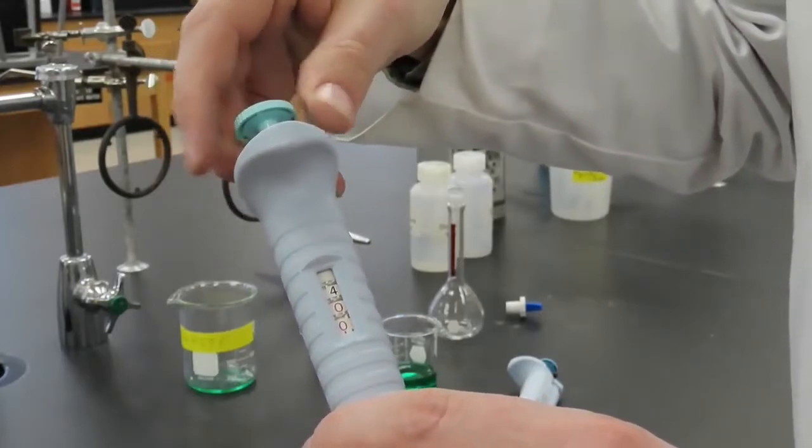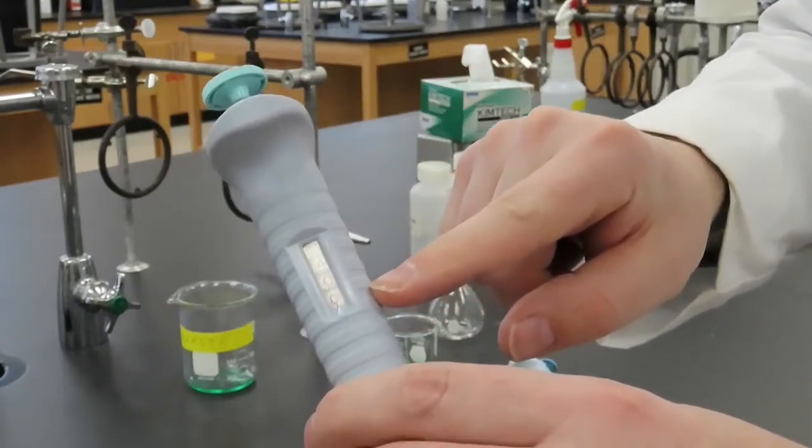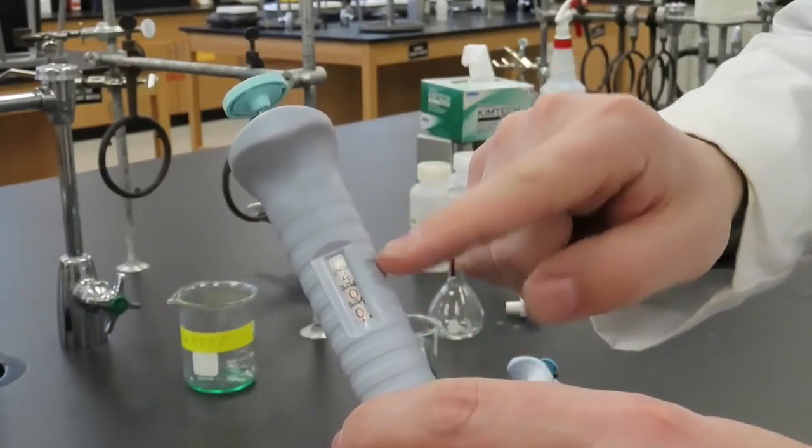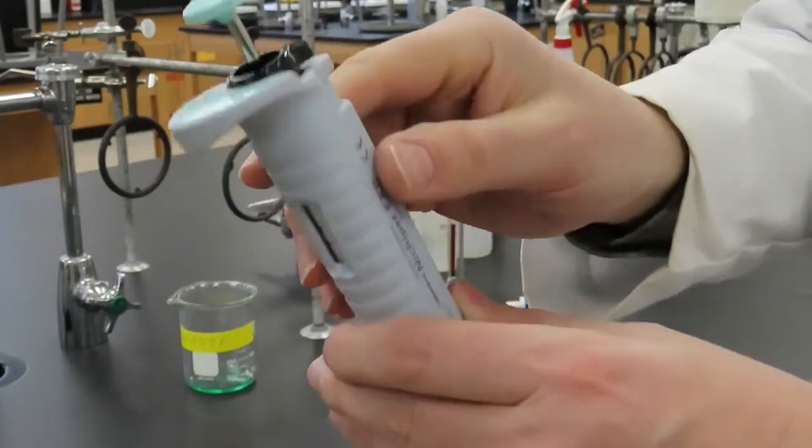Now it is set at 4.00 milliliters. If this is the volume we want, we then lock the volume locking ring and proceed.